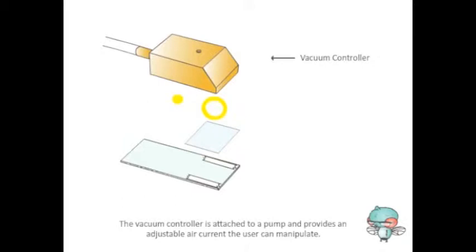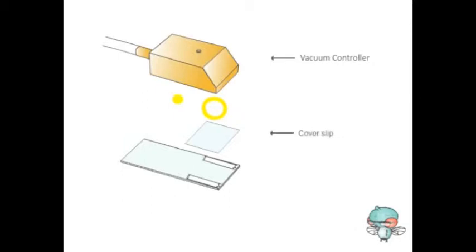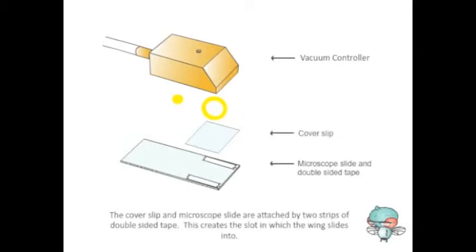The vacuum controller is attached to a pump and provides an adjustable air current the user can manipulate. The cover slip and microscope slide are attached by two strips of double-sided tape. This creates a slot in which the wing slides into.